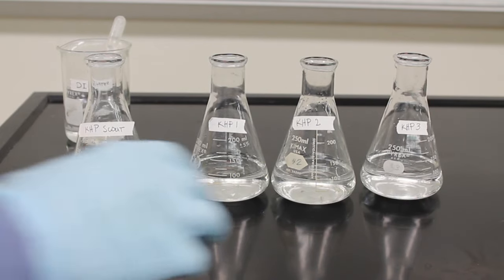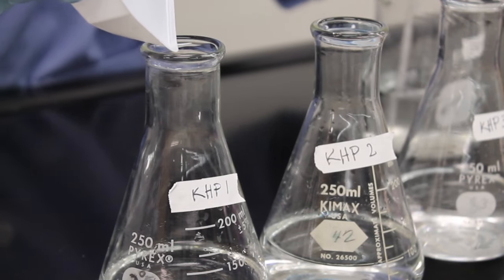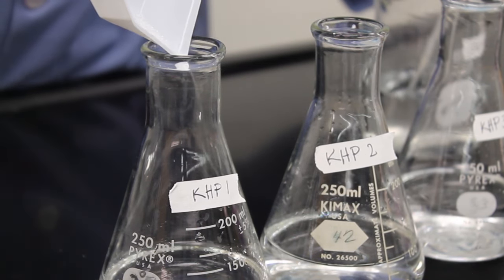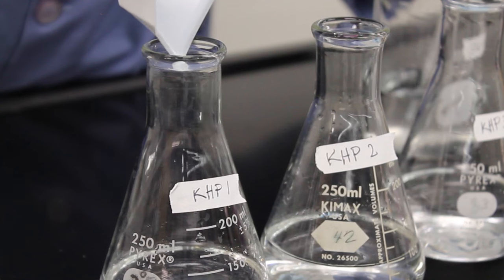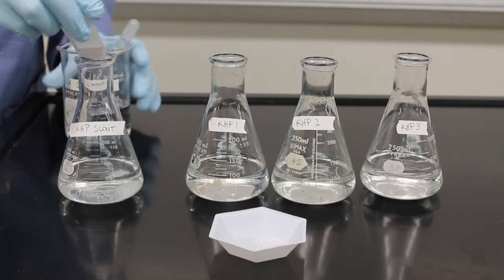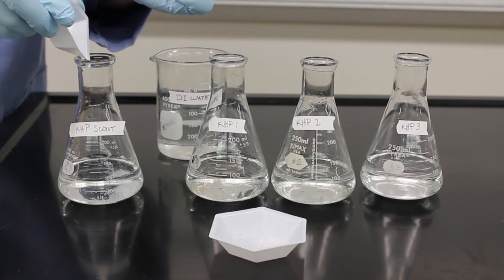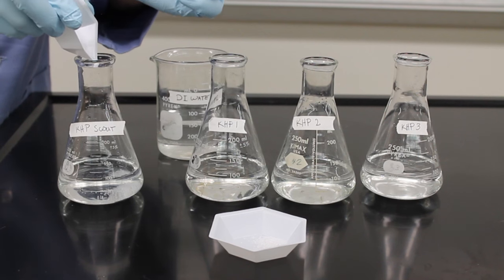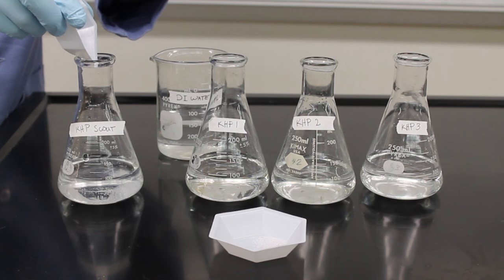Next, you will need to transfer your KHP to flasks that contain approximately 100mL of water. The exact amount of water doesn't make a difference, but the exact mass of KHP does. Remember, this is deionized water, not regular tap water. Rinse your weigh boats out 3 or 4 times with deionized water to ensure you get all your KHP transferred. This technique is called a quantitative transfer.